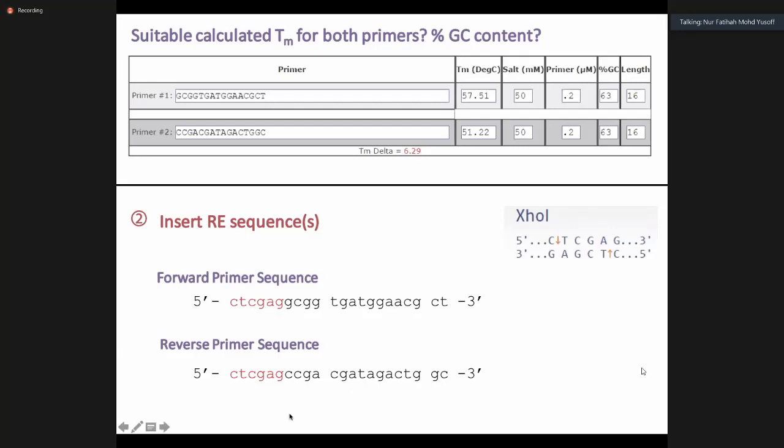If you only put one site, or use a different enzyme sequence, then it will be different from one end to the other end. Do you get it? Yes or no? Yes, doctor. If you don't understand, you can just ask me.